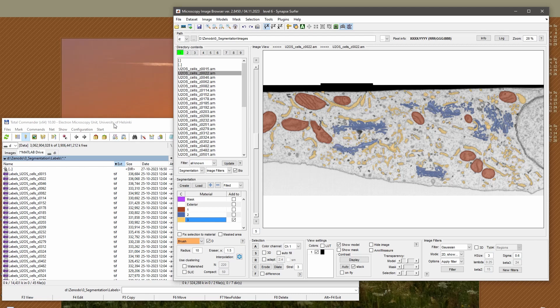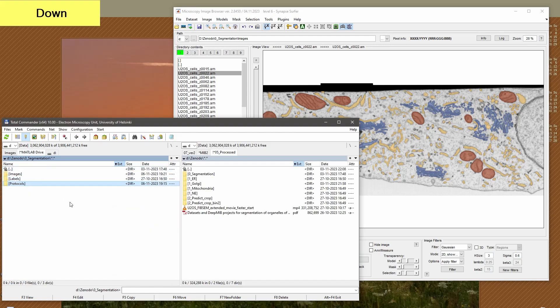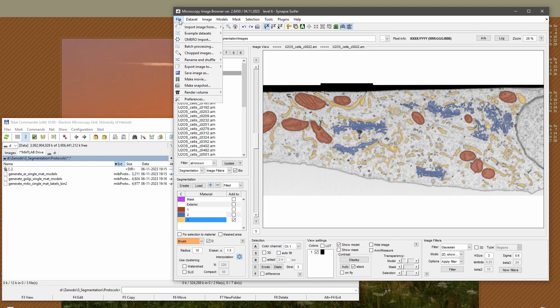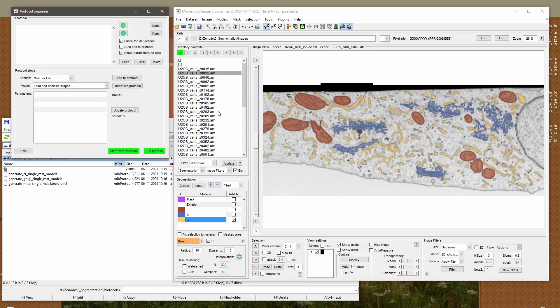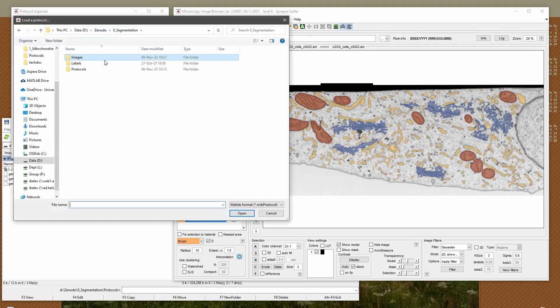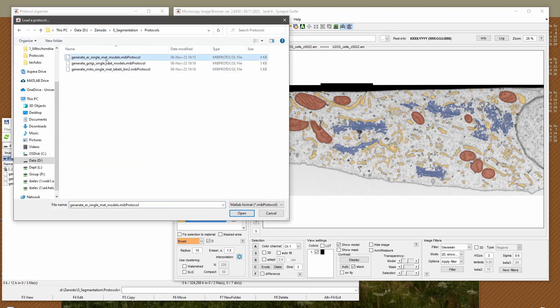For training we decided to train individual convolutional neural networks for each of these organelles to be a little bit more efficient. In order to generate the training sets for each organelle we have three different protocols. You can load the protocols using menu: File > Batch Processing > Load. Let's see what we have for the ER.